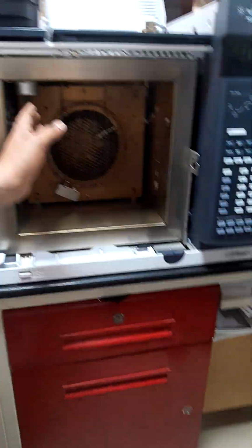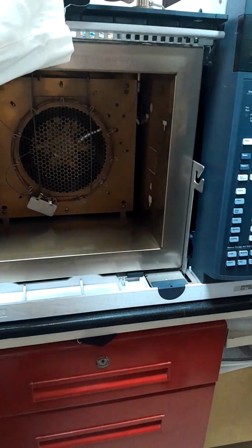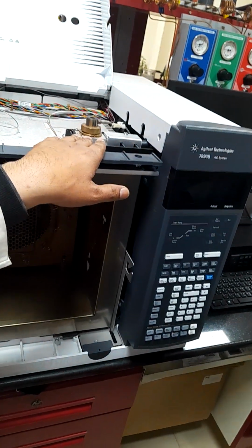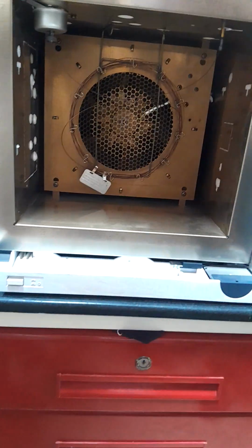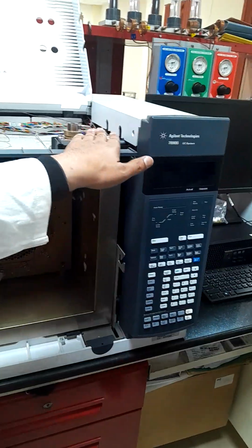This is our inlet. So the inlet is connected with this column. One end of the column is connected to the inlet, and the other end, the outlet point, is connected to the detector part. Here we are using an FID, flame ionization detector. It can be a TCD, it can be MS, or some other detector type you can also use here. But for our application we are using FID as the detector.